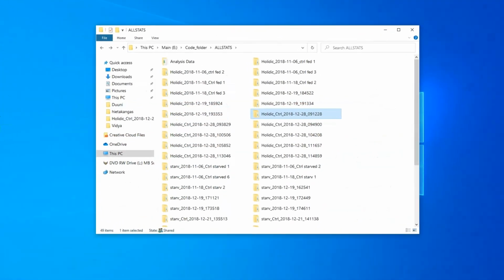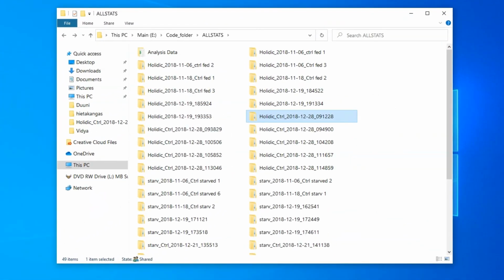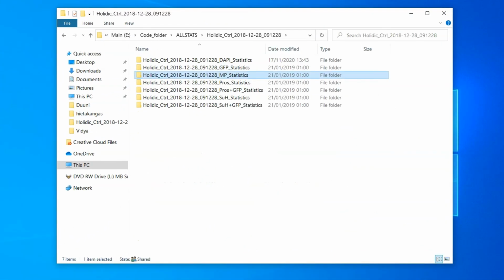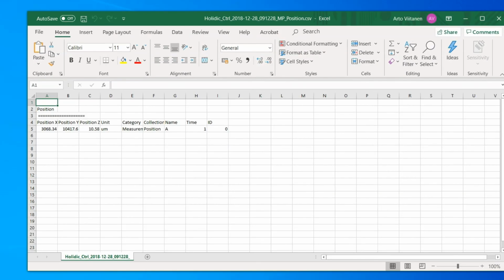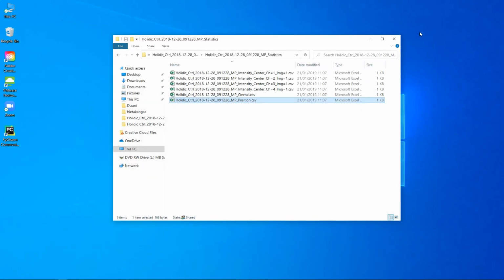The MP is provided by creating a channel folder with the name MP as per default settings. This folder should contain a position.csv with only one object that has its x and y coordinates. This object should point at a biologically distinguishable segment, such as the midpoint of the R3 region of the midgut.